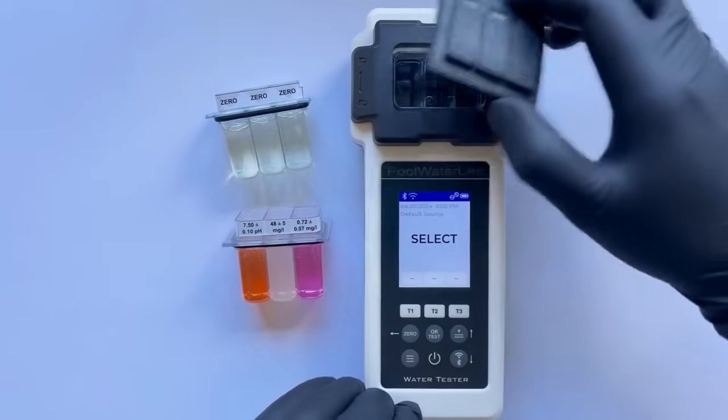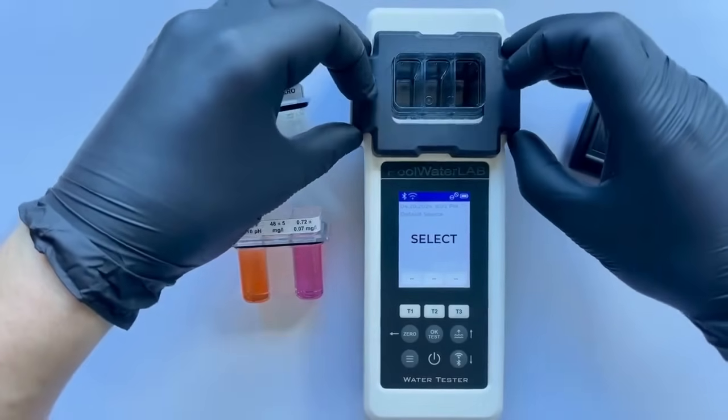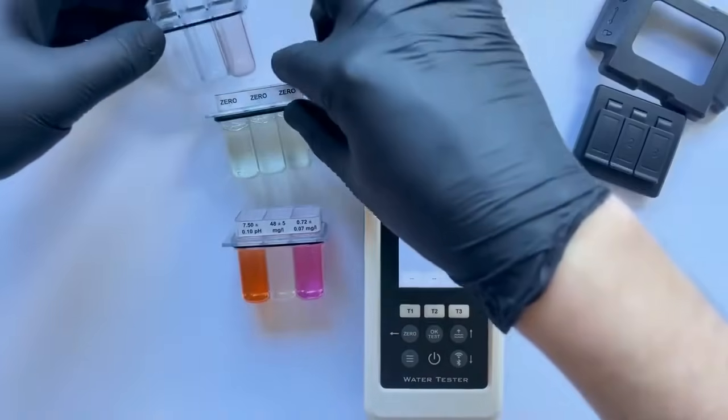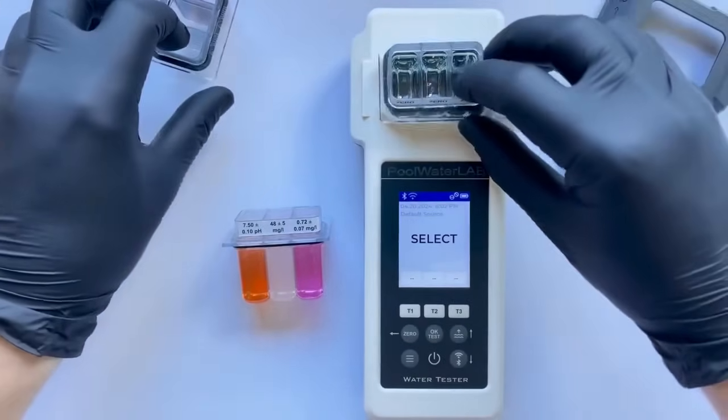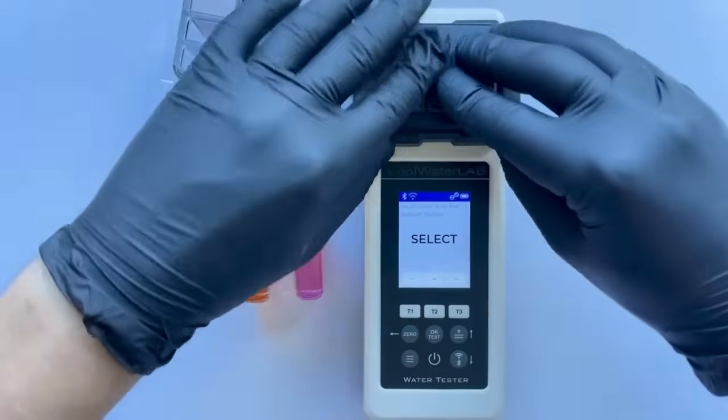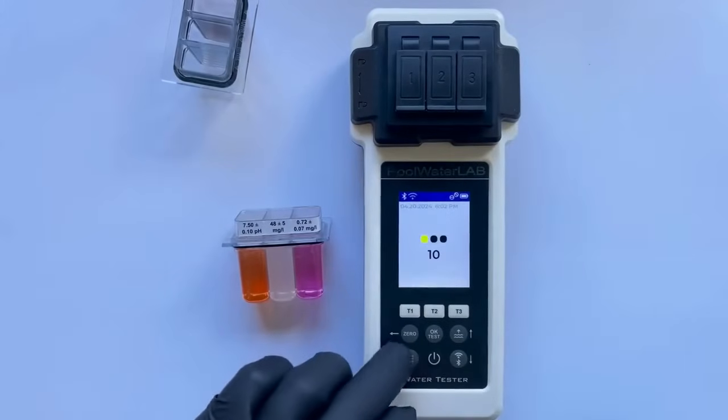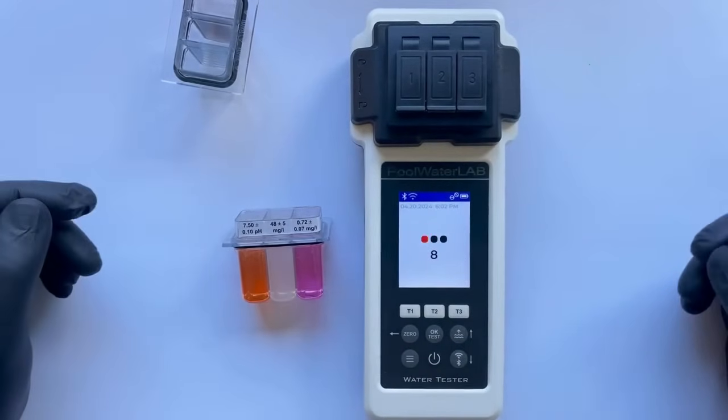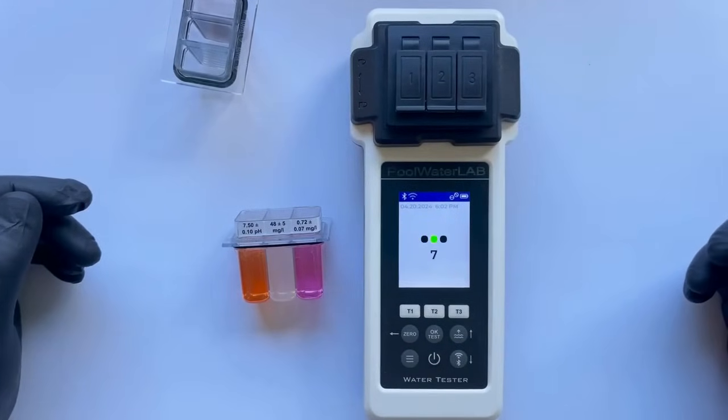Let's start by placing the zero sample with pure water and conducting the test. This step is essential as it ensures the tester is correctly calibrated before we proceed with further testing. Press the zero button to start the test and wait until the countdown ends.